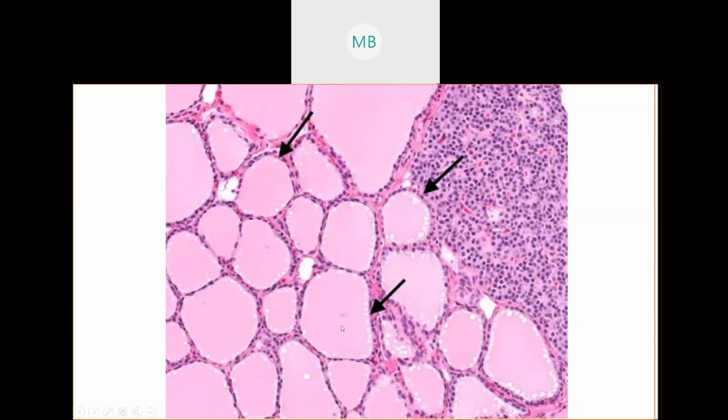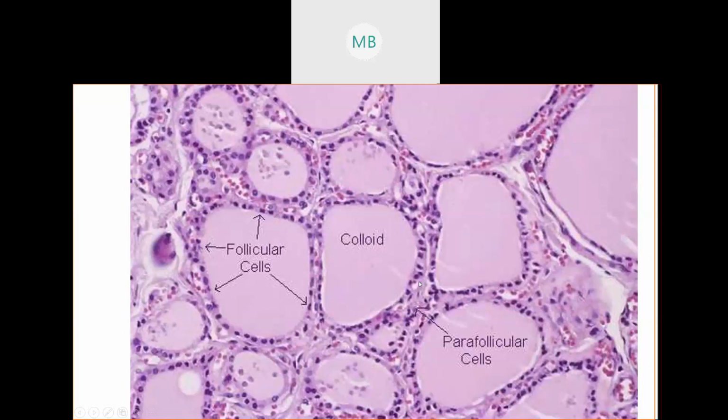The 4th term that you have on your lab list can be one of 2 things. I am going to edit your lab list for this. And here we have another picture where you have the follicular cells labeled and the parafollicular cells labeled. These follicles fill with a chemical that will inevitably become thyroid hormone. We'll discuss this a little more in lecture. But the chemical inside these follicles will, with iodine and some other means, become thyroid hormone, and this is where your body stores it.